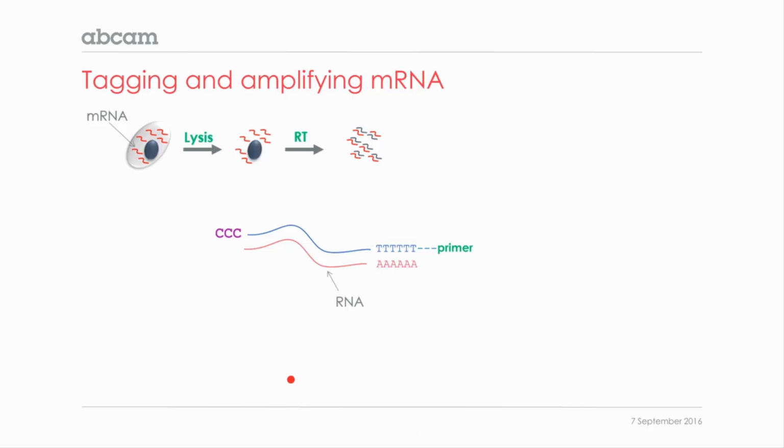In the same mix, what we usually have is an auxiliary oligo that we call the template switch oligo, which we add to the reaction in high concentration. And since it's in high concentration, and since we have GGG on the 3' side of this oligo, this oligo will tend to hybridize to the CCC, and then the reverse transcriptase enzyme will continue to copy into the same first strand cDNA this same oligo that we call the template switch oligo. And this whole process is called the template switch.